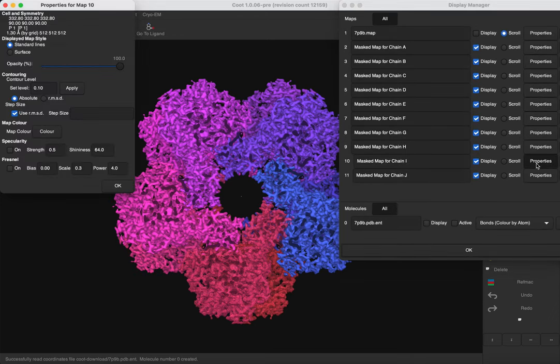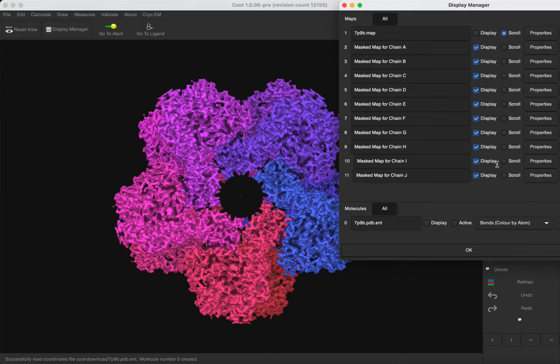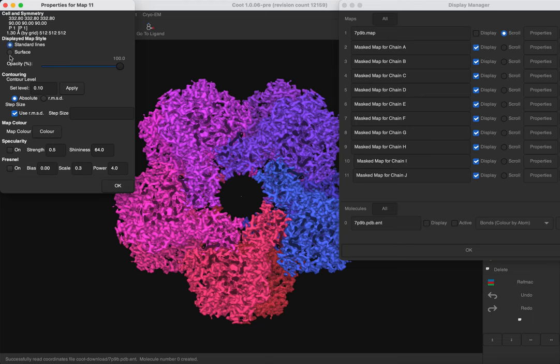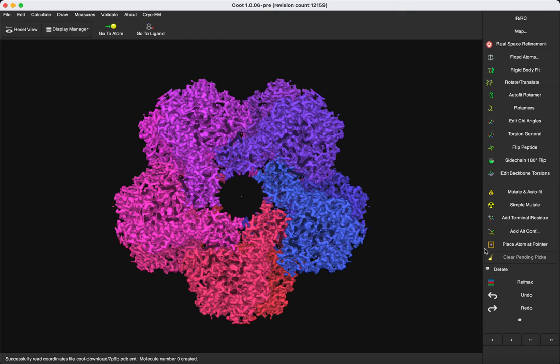You're going to draw all the chains, and you can see. So now let's increase the clip in front by pressing 1 on the keyboard.